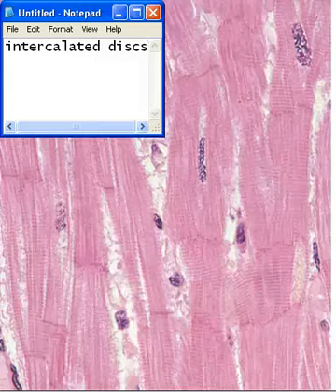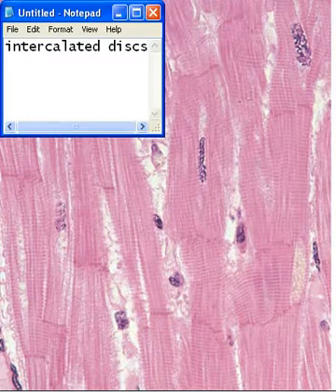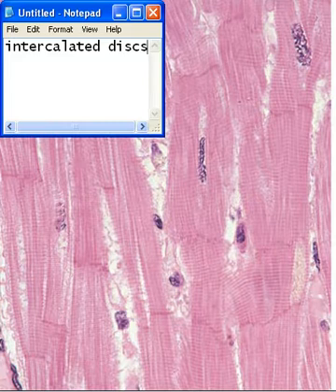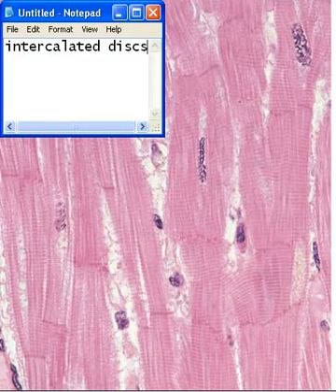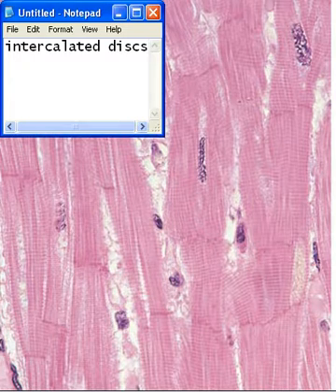Hello everybody, and today as of now, this is the last muscle tissue that I will be showing you for the night. So, it's cardiac muscle, its function is to pump blood, and its location is in the heart. It's pretty simple, obvious.